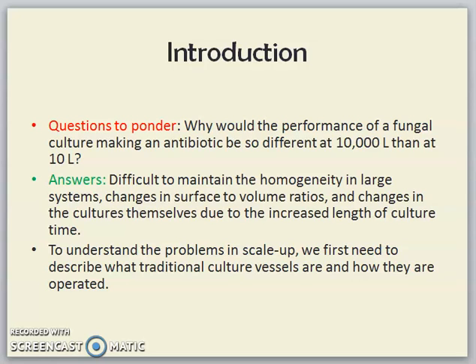The answer is, it is difficult to maintain homogeneity in large systems, there are changes in surface to volume ratios, and changes in the cultures themselves due to the increased length of culture time. We need to understand the problem in scale up, in which we need to describe what traditional culture vessels are being used and how they are being operated.